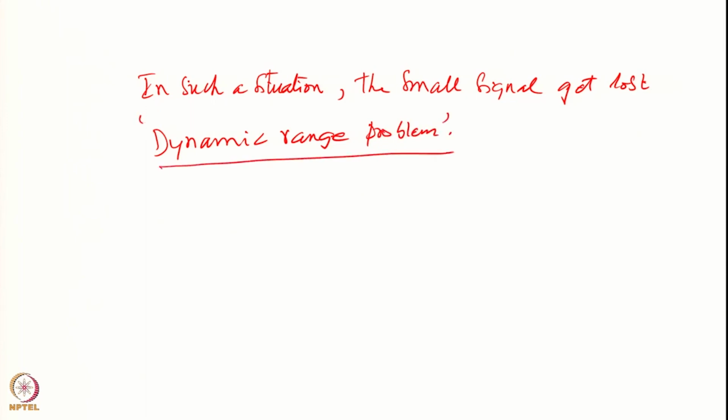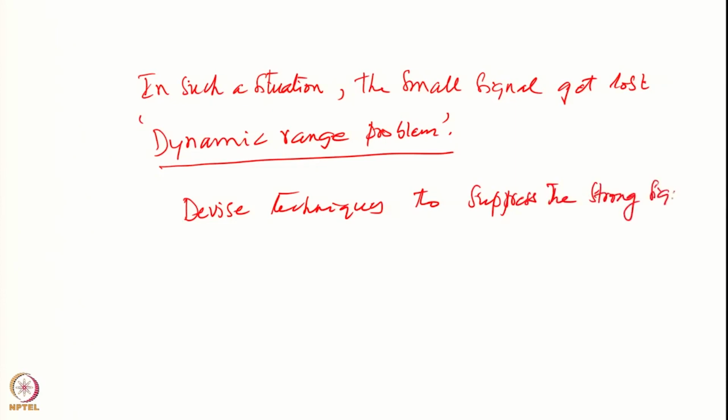So, what should we do to avoid this? We have to devise techniques to suppress the strong signal. Most often the strong signal is from your solvent.